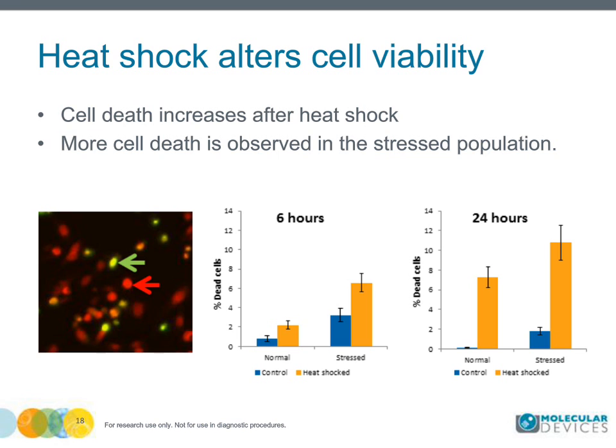And that's echoed in the 24-hour results, where we see an enhancement of the percent dead cells in the heat shock treatment. So again, what this suggests is that all or most of the cell death that we're seeing is probably due to apoptosis, and we could certainly take this hypothesis and further investigate it through some follow-up assays on the same system, for example, using things like caspase inhibitors. But this initial data does give us the hypothesis to work off of.